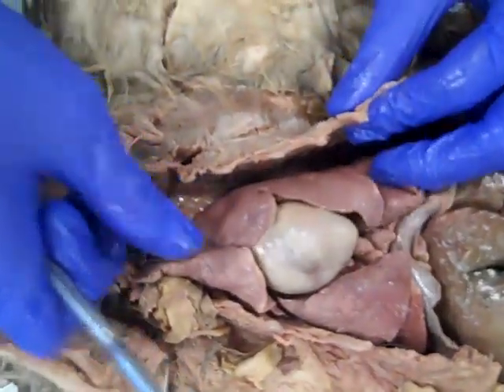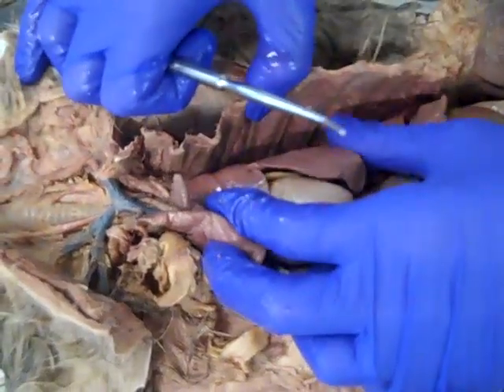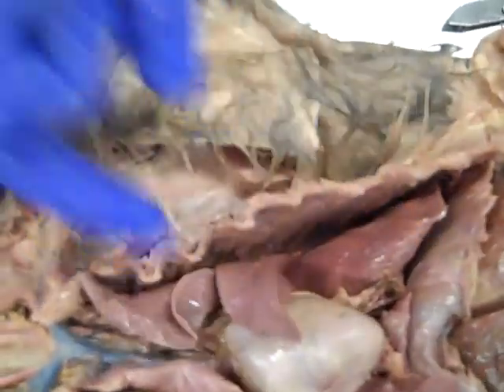Not quite as many lobes — three on the left, four on the right. If we look on the inside of the rib cage, we can kind of pull that apart. We can see another shiny membrane right in there, which is the parietal pleura.